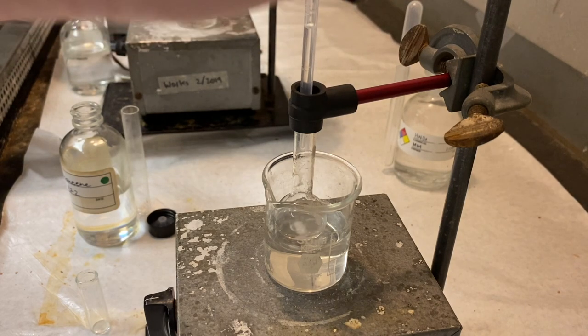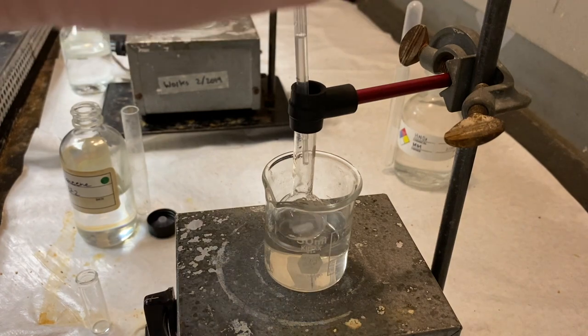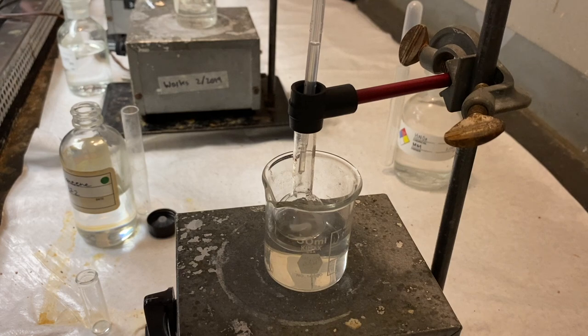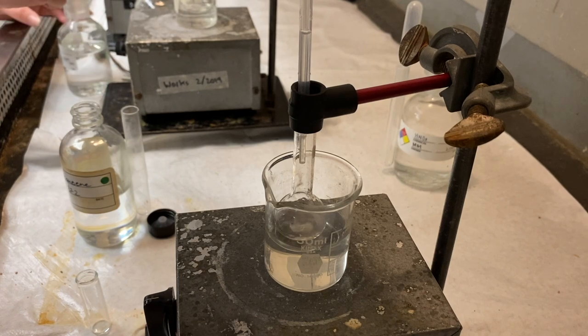Once we've done that, we'll let the reaction sit for ten more minutes and then continue on from there. So at this point we'll just have to do all these addition steps. So I'll probably just start a little time lapse now.